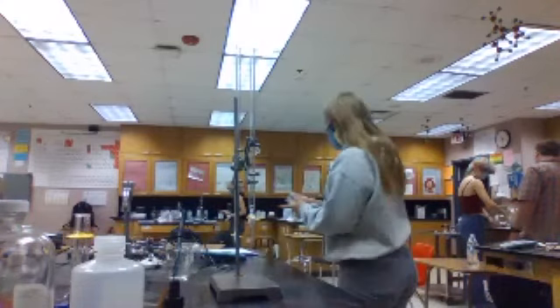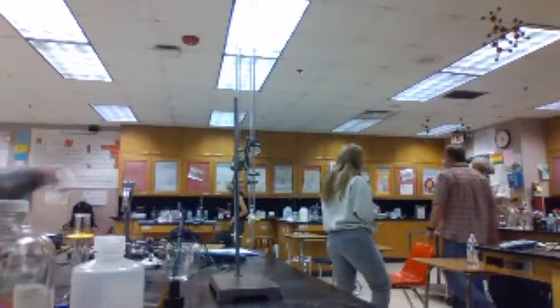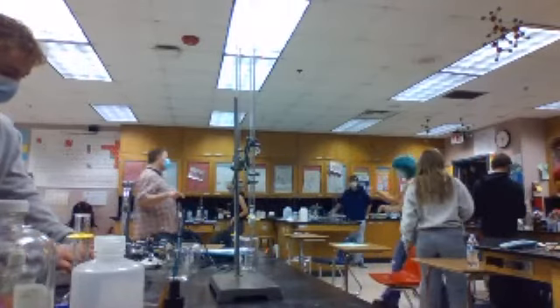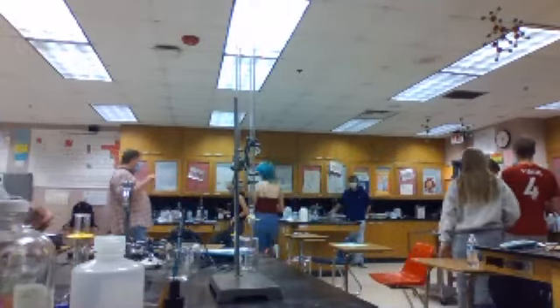Okay, I'm going to go get that. Are we getting our base? Probably got enough time for one trial, so that base, if you have 10 milliliters of the acid, that base should be less than 10 milliliters, just to let you know.